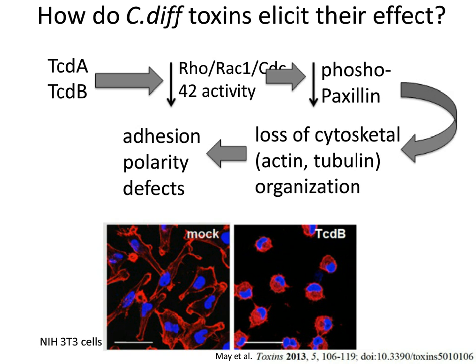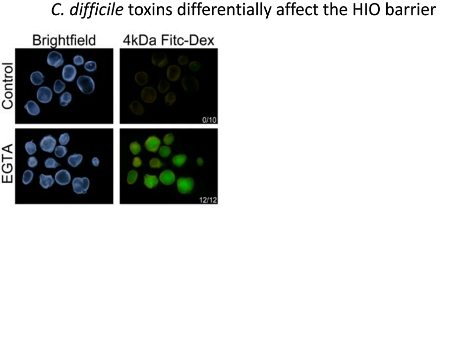Okay, so back. What happens when we add these toxins to the organoids? This is a control, both a negative control and a positive control. This is the same experiment that I showed you before, where we add nothing, with no disruption of epithelial barrier function. If we add the chemical, we can see a nice, robust barrier loss, so we've injured the barrier in this case.